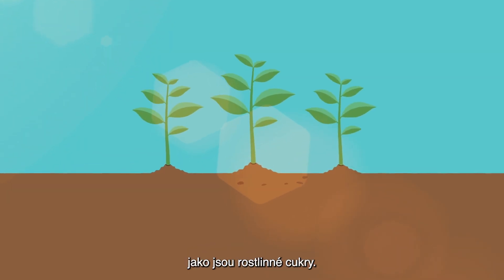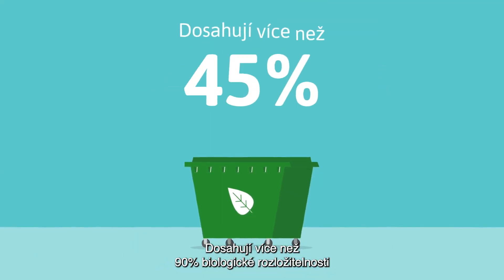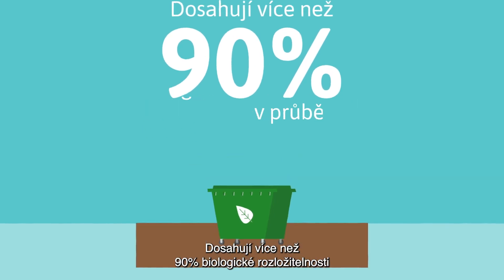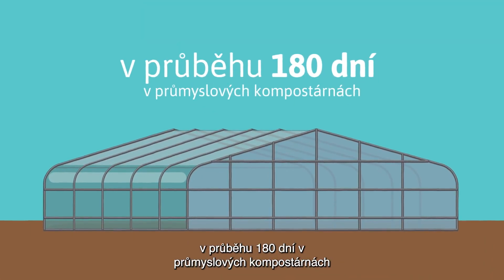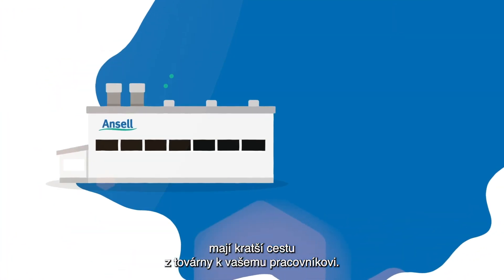This means both the gloves and the poly bag packaging are compostable, achieving over 90% biodegradation within 180 days in industrial composting facilities. And because they are manufactured in Portugal, there are shorter transit distances from the factory to the worker.